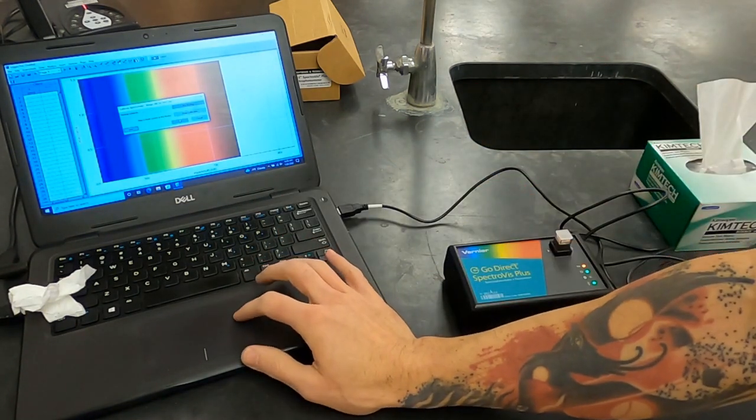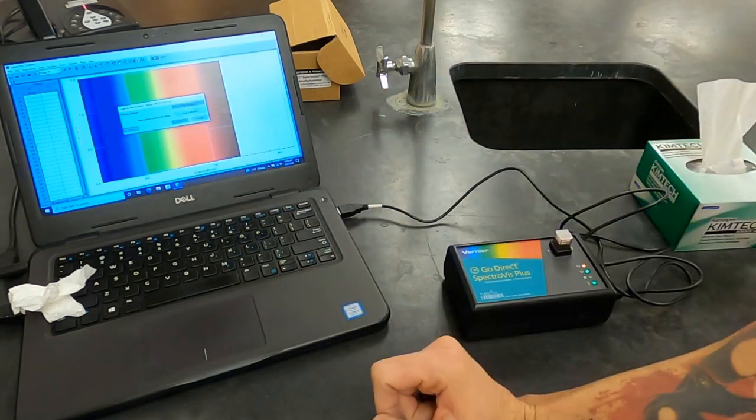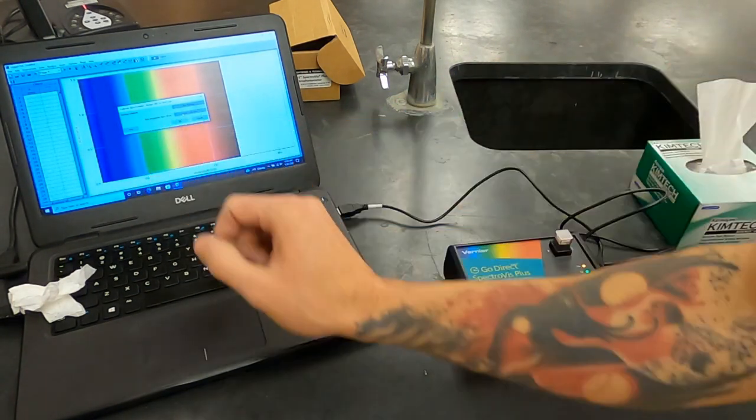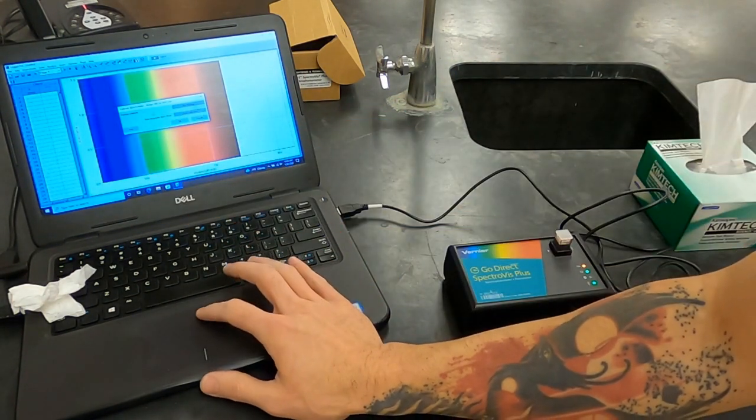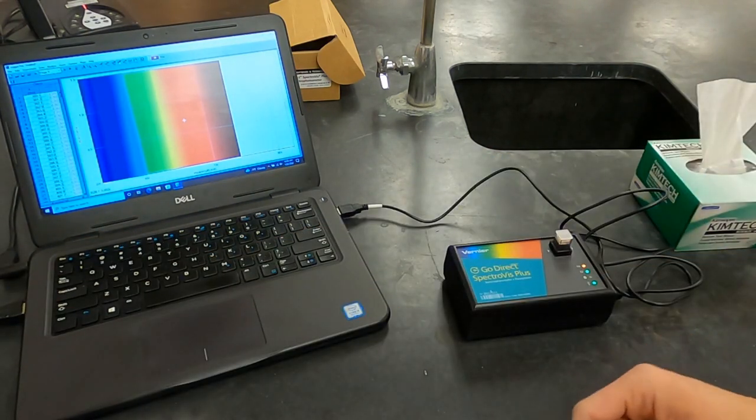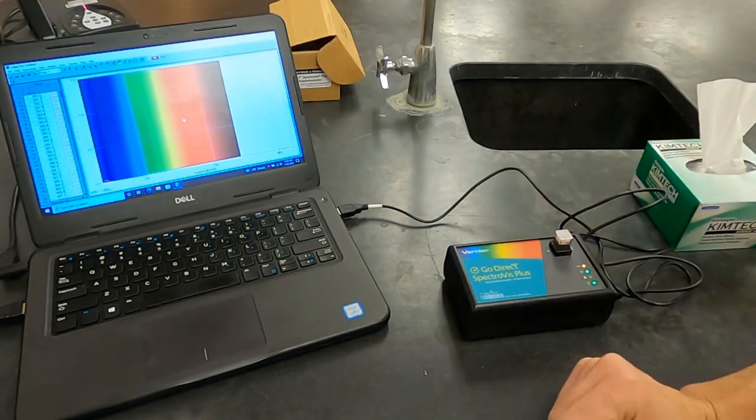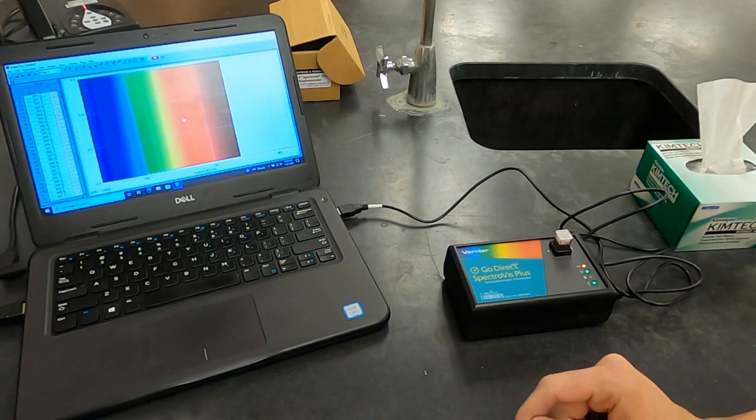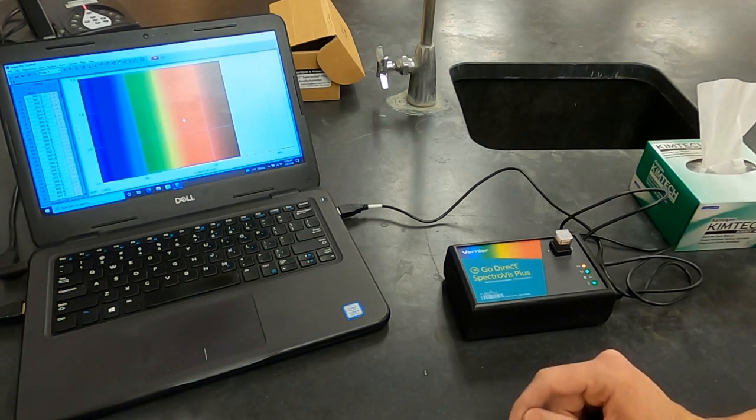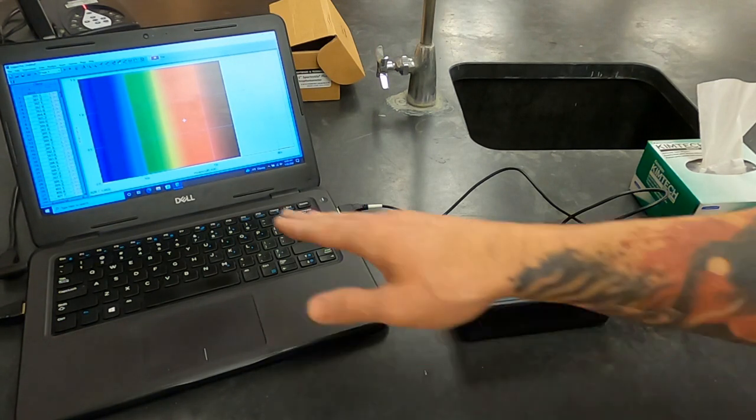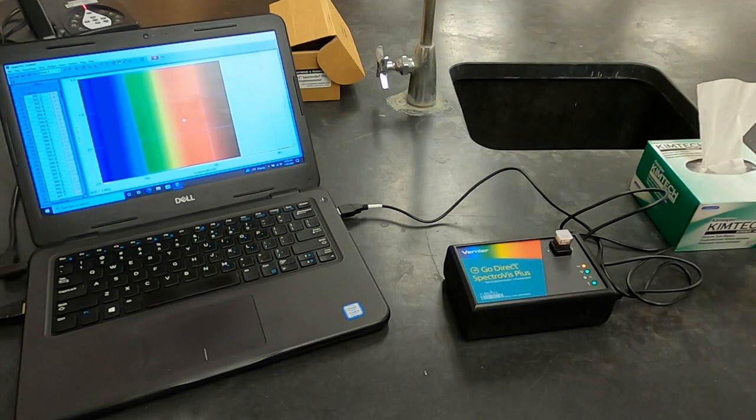So now that it's warmed up, we hit the finish calibration and it does tell you to have a blank cuvette. It will tell you how long it needed to scan to integrate. It says warm up complete and you say OK. Now it might not look like it's doing anything, but notice it is collecting data. The stop button is available for you to hit. There is a line down here, so this is showing how much light is being absorbed by the water. So it should be zero and that's why you calibrate it so that it knows where that line for zero should be. So at this point, I'm going to put in my first sample yellow six.